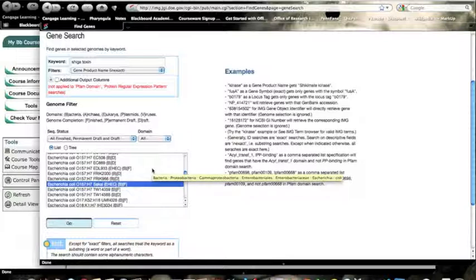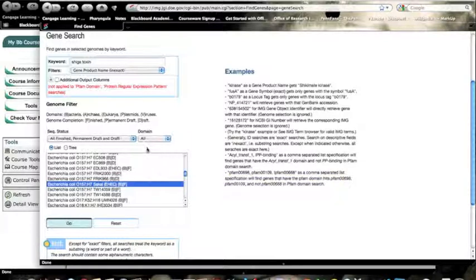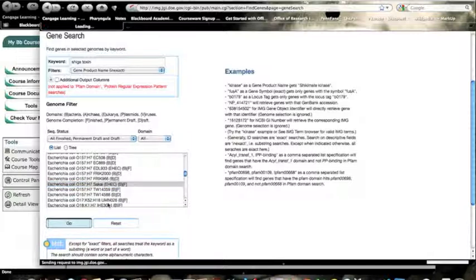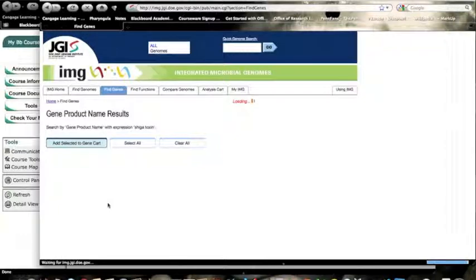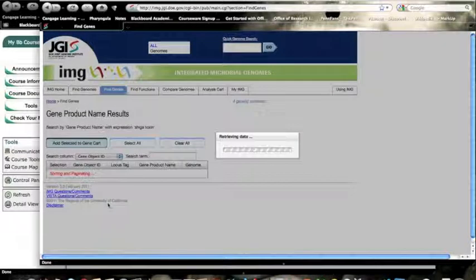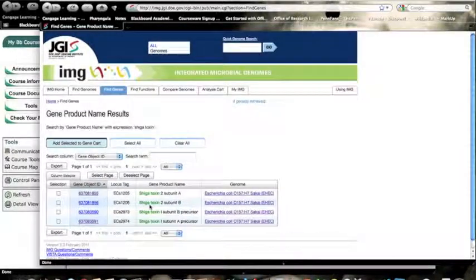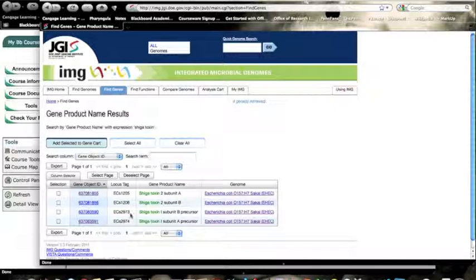You could play with different versions if you want to, but I want to keep it simple. So I'm going to look through Sakai for this Shiga toxin. And I hit go. And there we go after a brief moment. We have all of the ones we found in there.